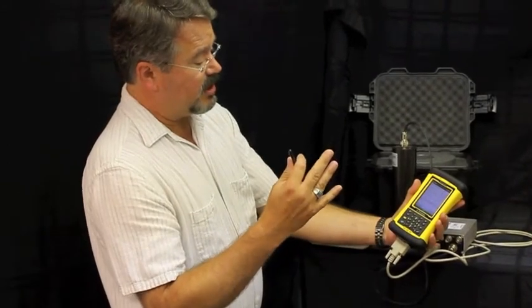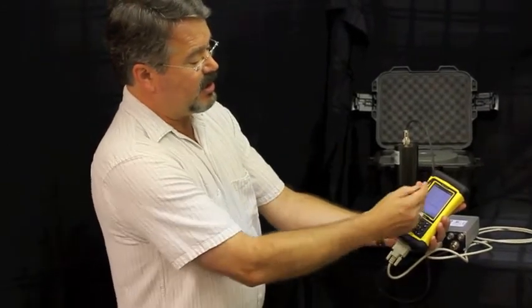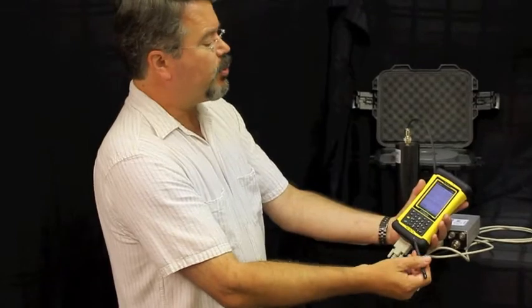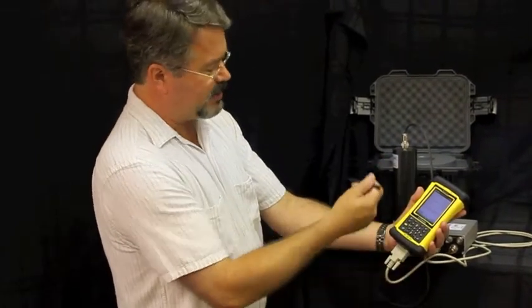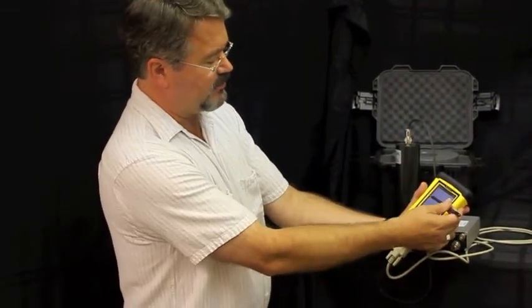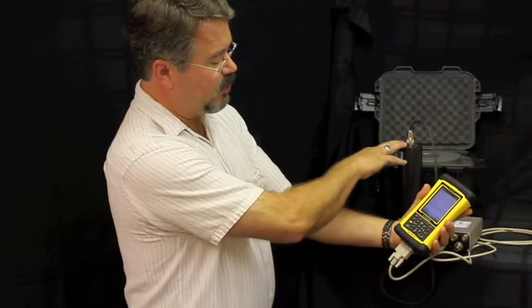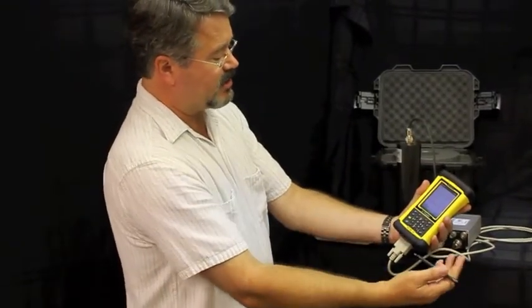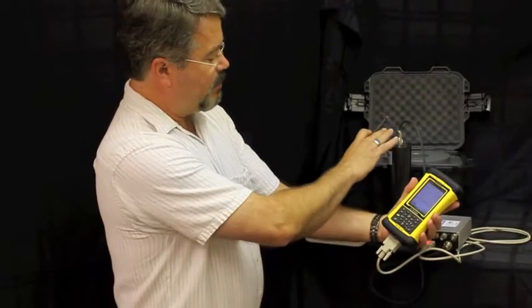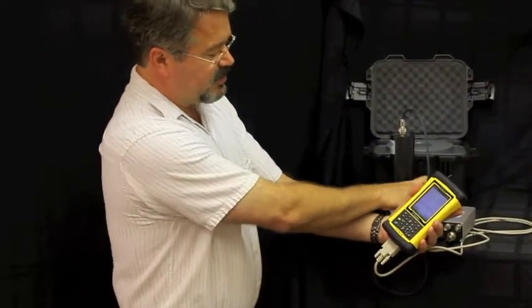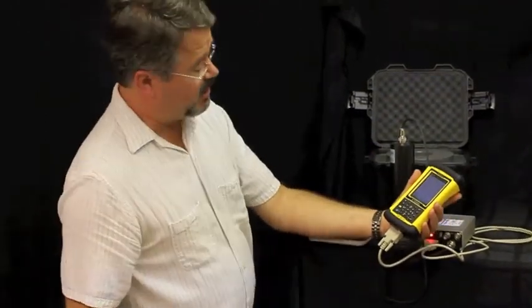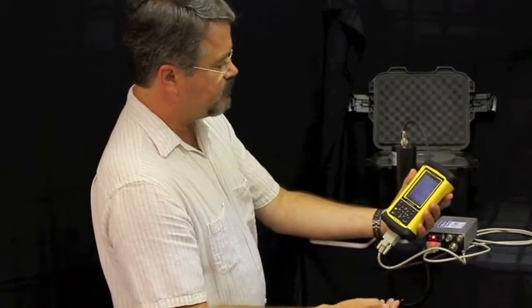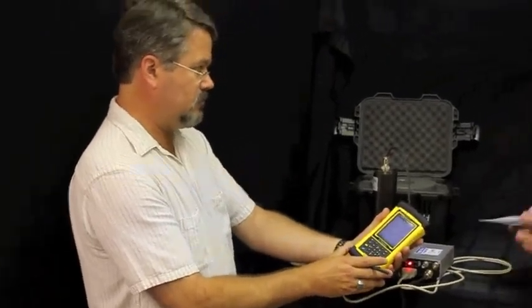As far as voltage, high voltage coefficient, gains and so forth that mate the detector specifically with the multi-channel analyzer. The menus, Mark, I believe are very well spelled out also in our manual with nice screenshots of each window, so for a non-technical user it's a very simple manual.